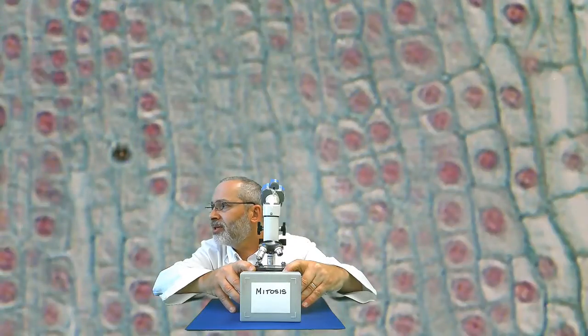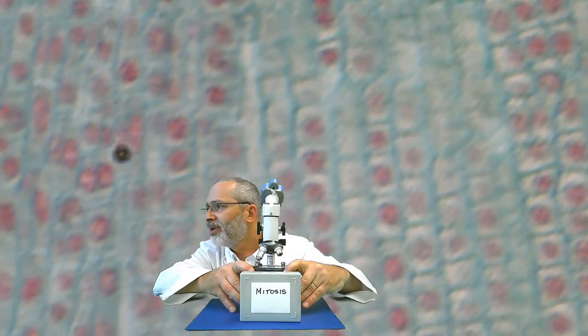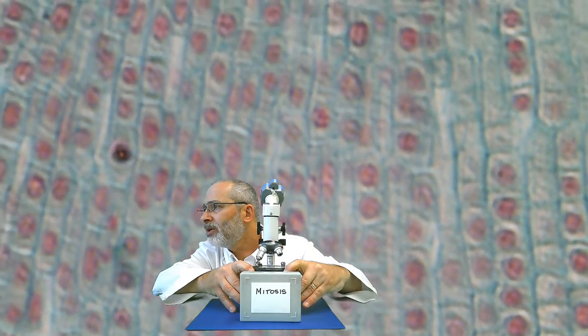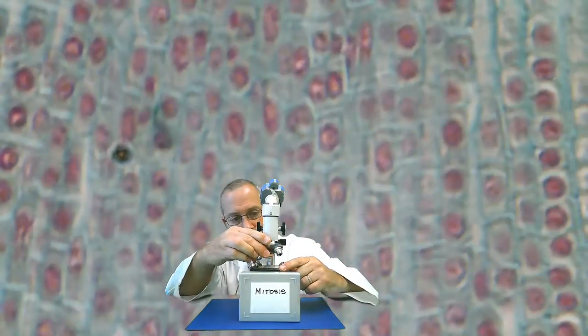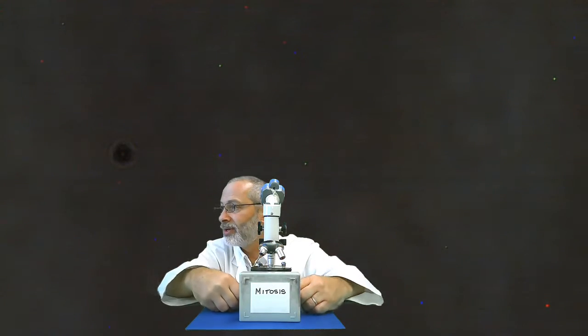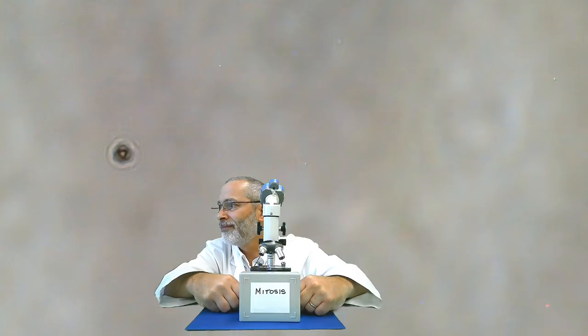So we can be hunting around, looking for clusters of cells undergoing something. And we're going to zoom in a little while. Maybe this one here by the smudge, I'll put it right over my head. And now I'll zoom in to the high power. I may have bumped the slide a little bit, but that's okay. And it is completely dark, which means we're under high power. We have to go to high light. High power, high light. So I've turned the lamp up a little bit more.